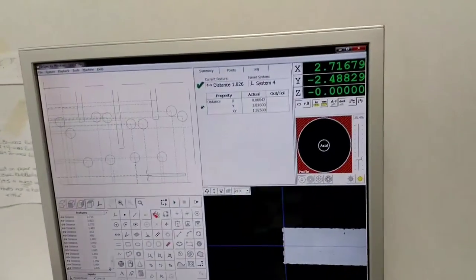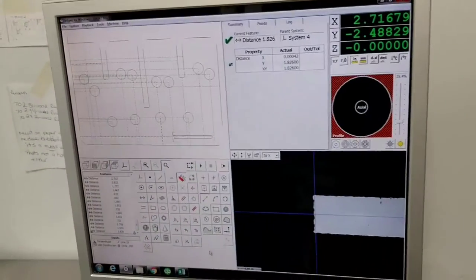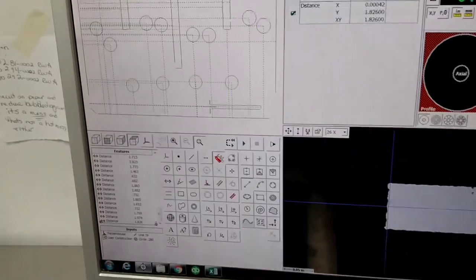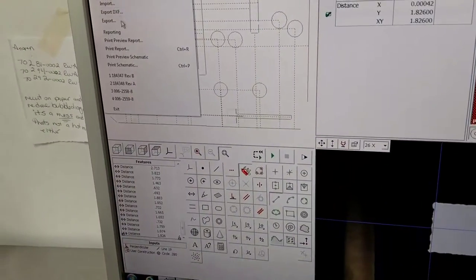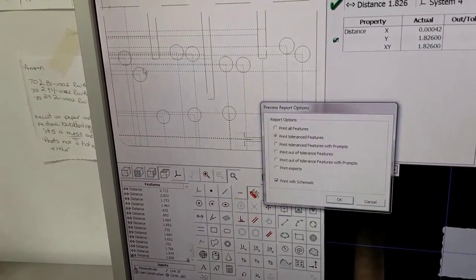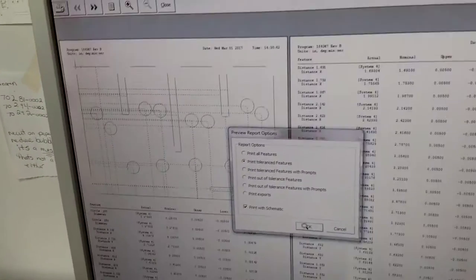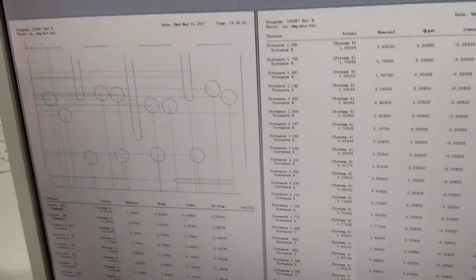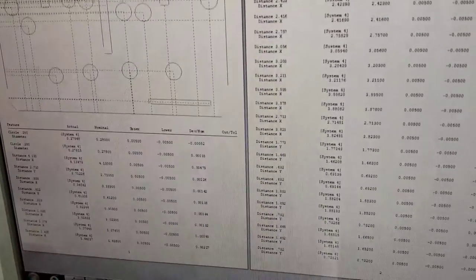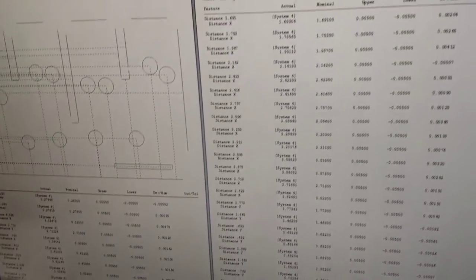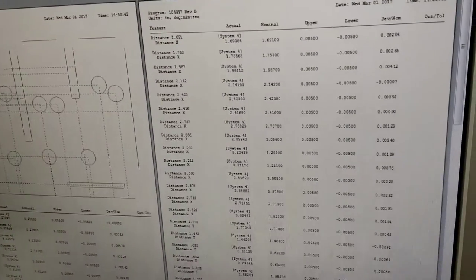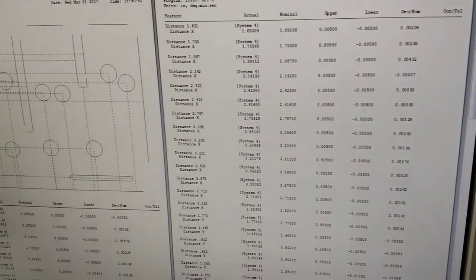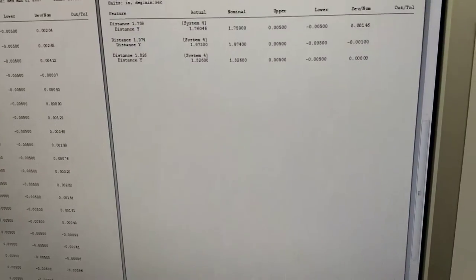Now we're done and we can see the report. It generates a report for all the dimensions and radiuses that we measured here.